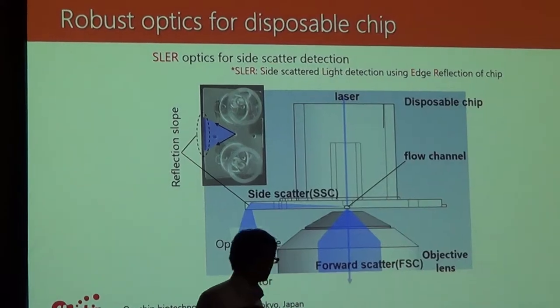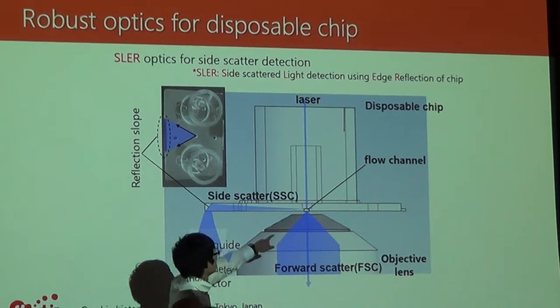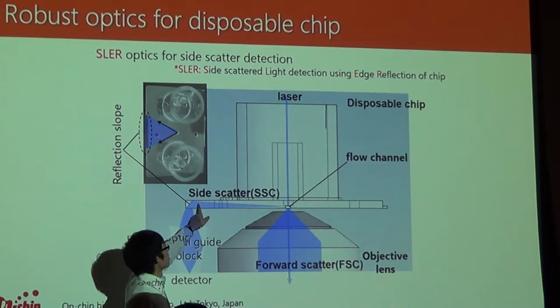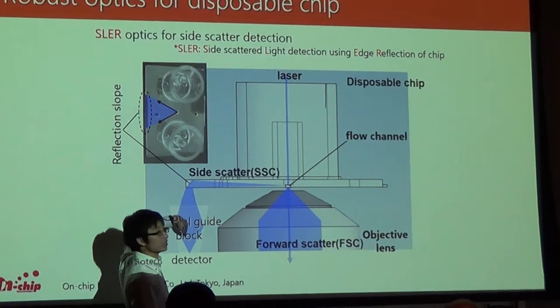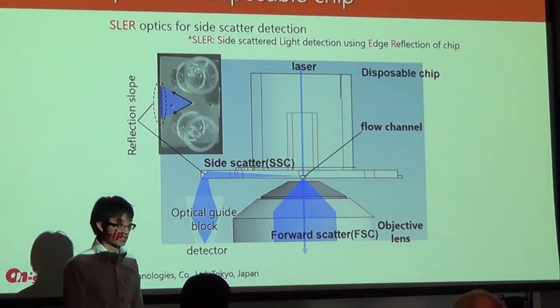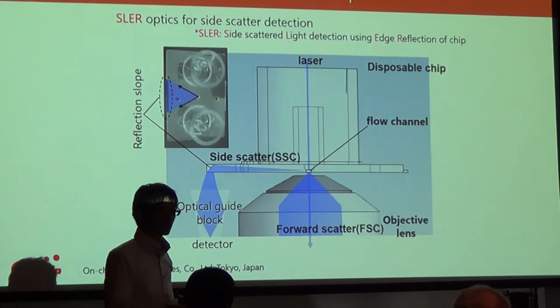How we do the side detection is that we have a chip, and that's where the channels are. When all the side scattered light goes through, we have an edge on the chip that reflects it downwards, and that is focused down, and we have a detector over here. So that reduces the overall space of the optics.